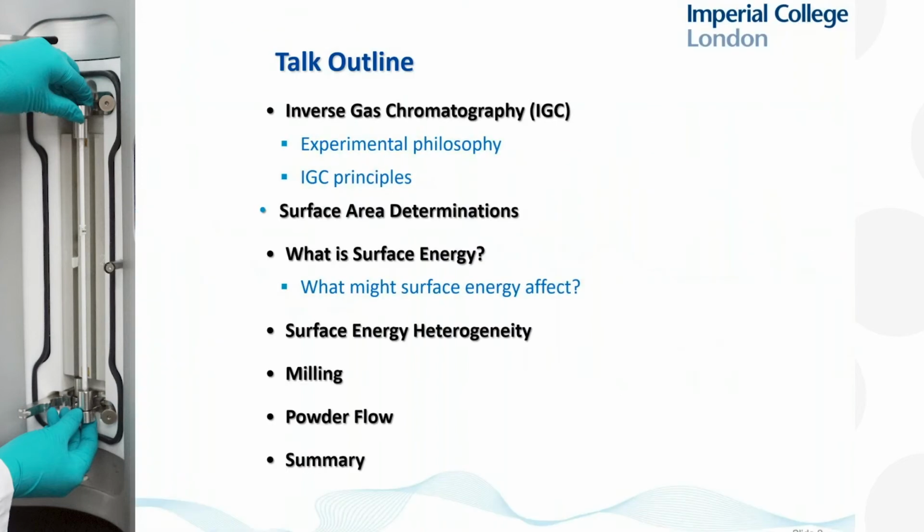So the talk outline is as given here. I'll be talking about the IGC method to start with. We'll have a brief introduction to surface area determinations, but most of the presentation will be about the surface energy and how that is an important property for understanding the performance and behavior of pharmaceutical solid state dosage forms. That will be the major theme of the presentation.